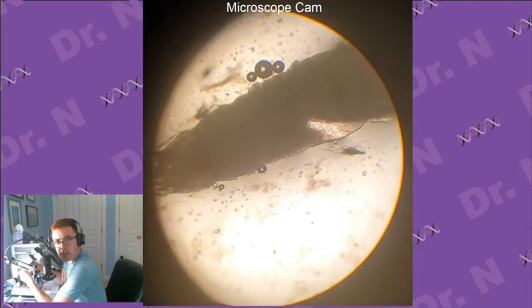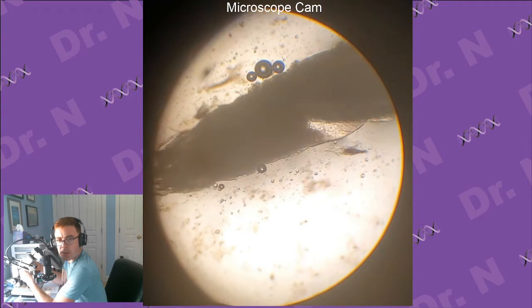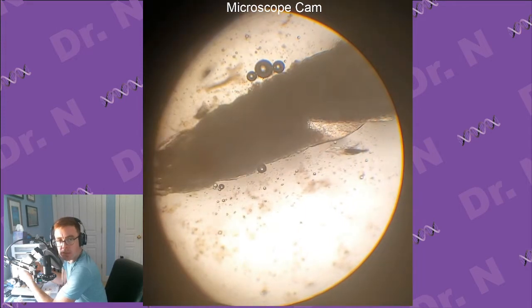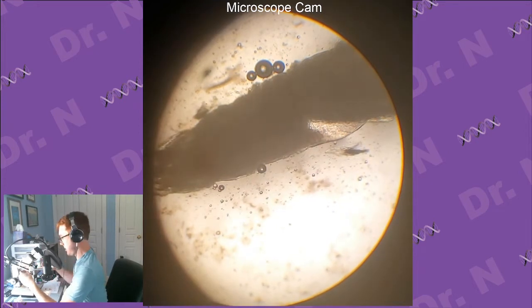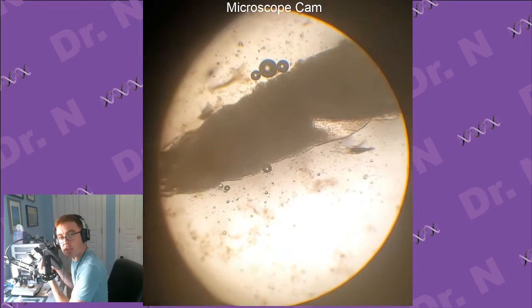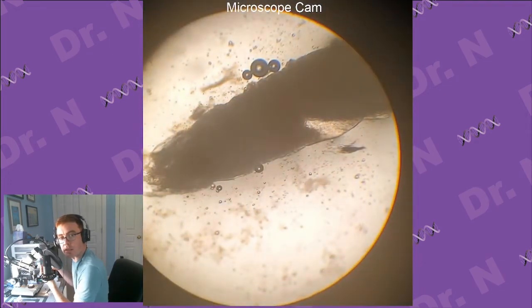So I'm not doing a great job. I think the preservation might have kind of stiffened them up more than I'm used to. Also, as cruel as it might sound, when they're alive and you kind of poke their heads, they kind of invert themselves a little bit, so then you just push them all the way through. Also, the microscope setup isn't helping, so it's a little bit of everything. Speaking of which, I think this is shifting a little. Yeah, absolutely. There we go.